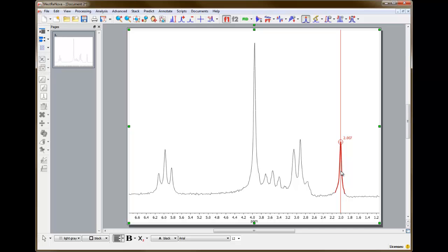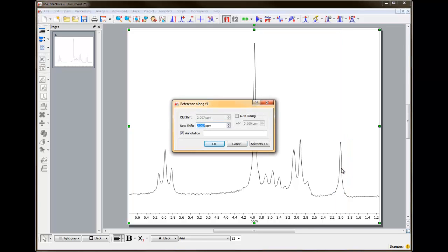Select the shift reference peak by clicking it, and a dialog box will appear. The new shift box displays the current chemical shift of the selected peak. By typing in a new value and clicking OK, the entire spectrum will shift according to the assigned value.